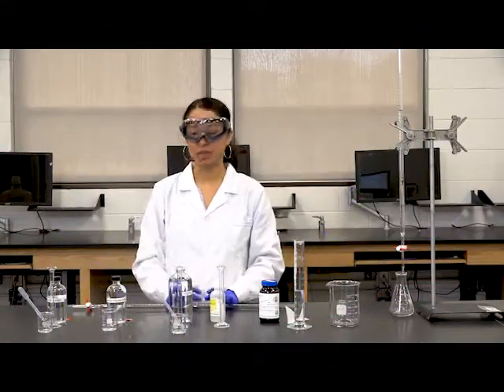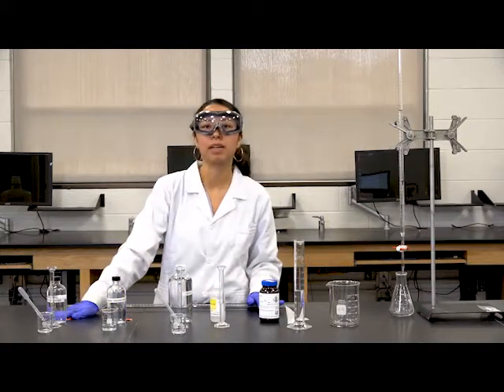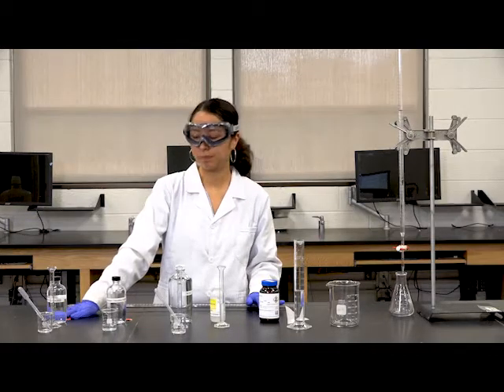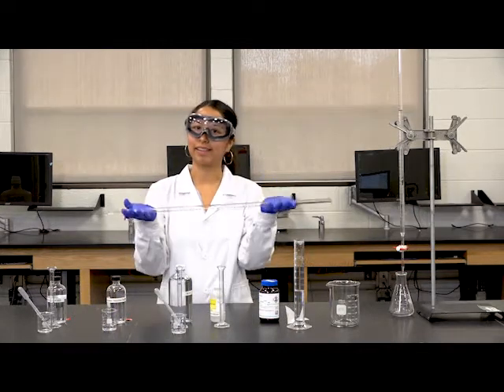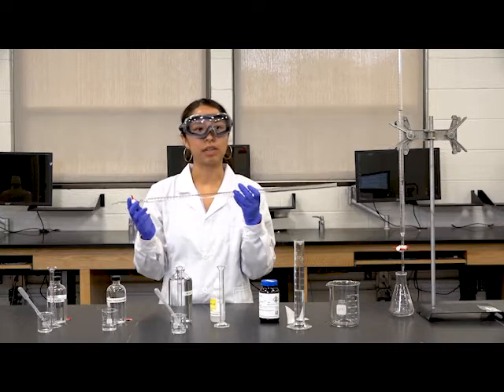For this demonstration, we're going to be doing the common ion effect experiment, meaning that we're going to be using the calcium iodate solution in 0.01 molar potassium iodate. First thing you want to do is to set up your burette. Your burette looks like this. Make sure that your burette is closed before trying to clean it.